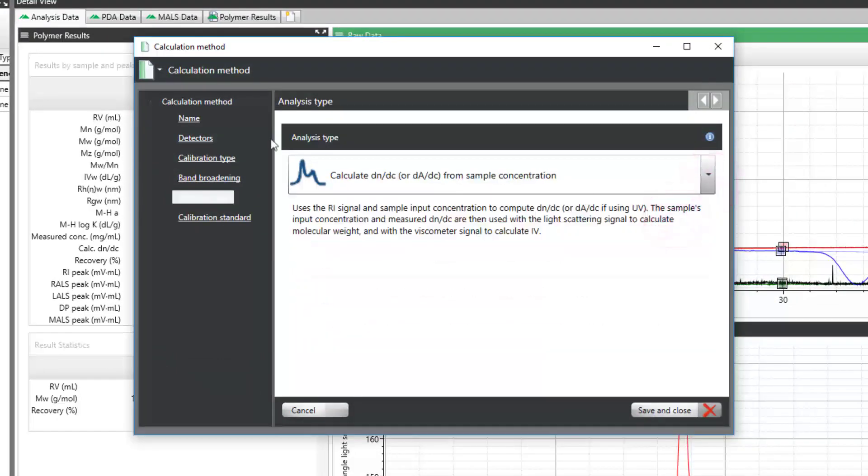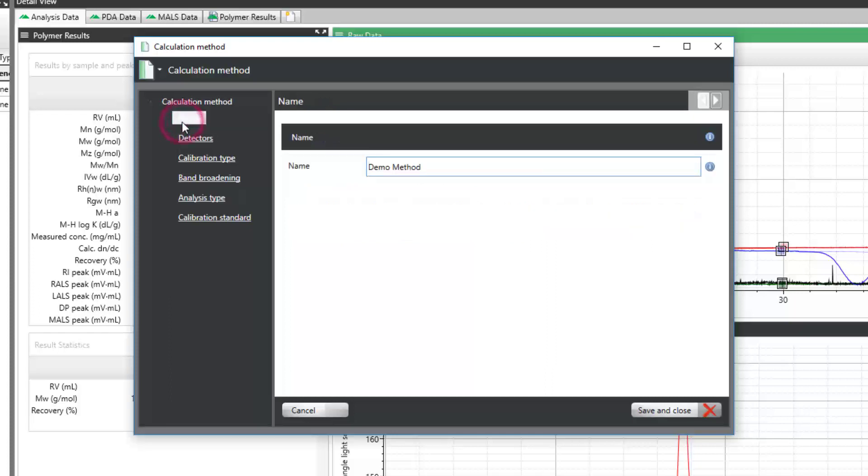After you do this, I recommend adjusting your calculation method name to indicate that DNDC will be calculated. Then finish creating or editing your method and click Save and Close.